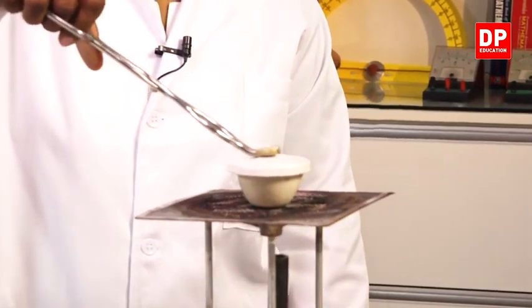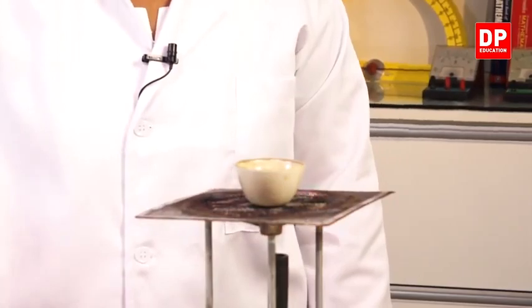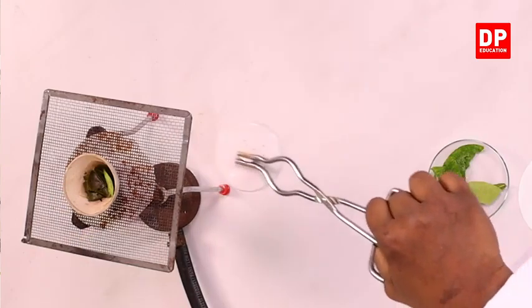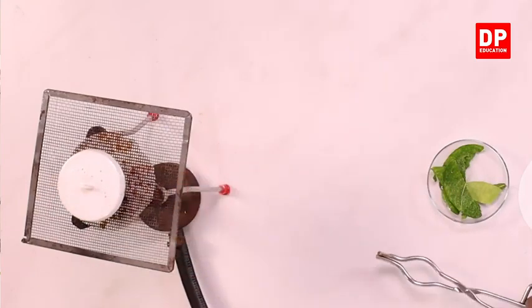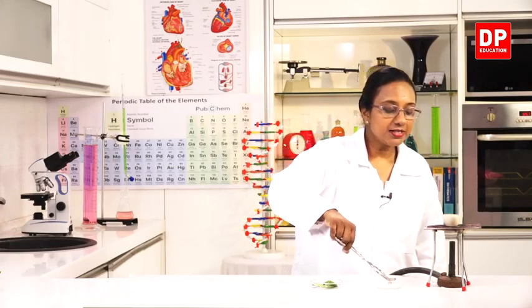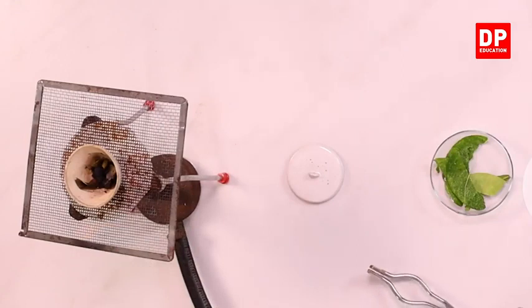Again, if I remove the lid, you can see that the leaves are turning in color. They are almost becoming brown in color, and when we keep on heating it, they will become more and more dry, and finally we will end up with our required end product. I will close it again and let it heat. Now again I will remove the lid. You all can see, students, that the sample has become black in color. We will leave it for a few more seconds.